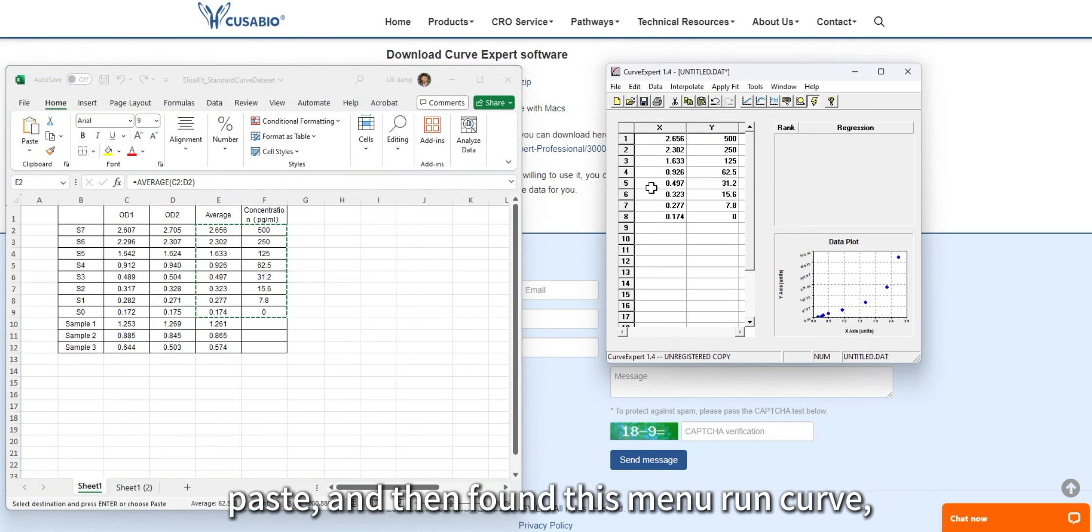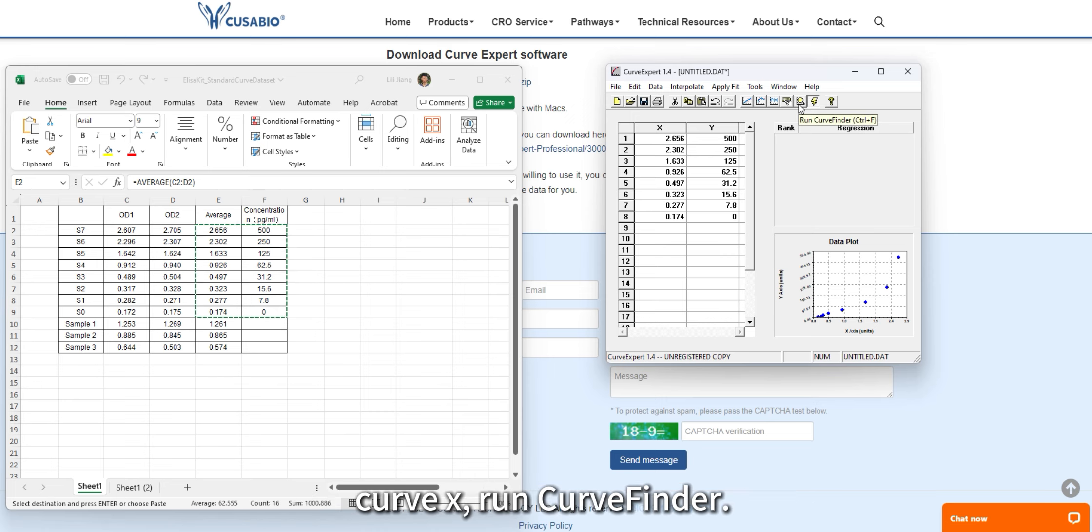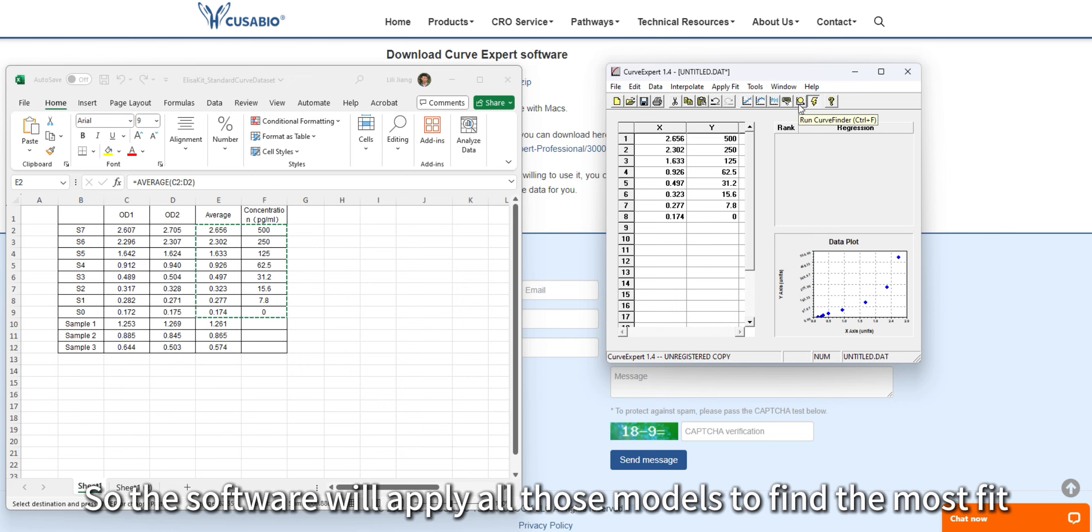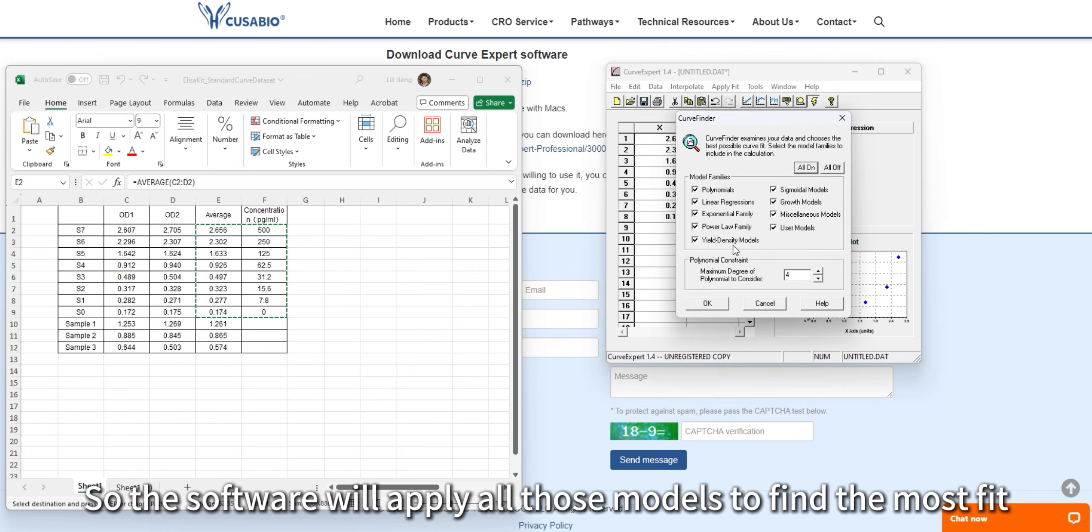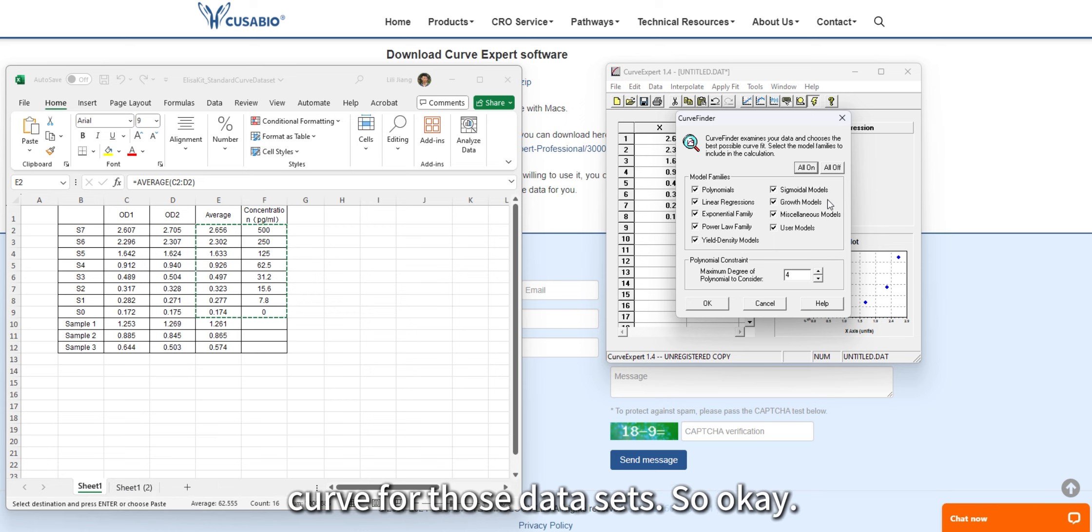Then find this menu, select CurveFinder, and run it. The software will apply all those models to find the best fit curve for those datasets.